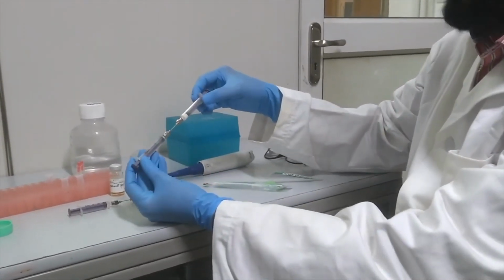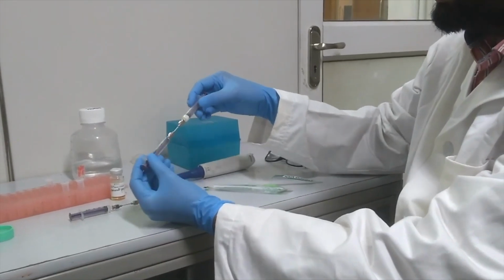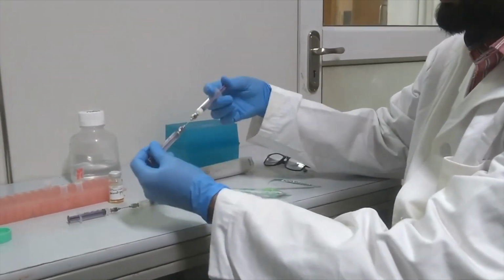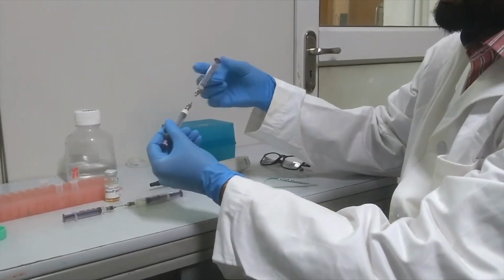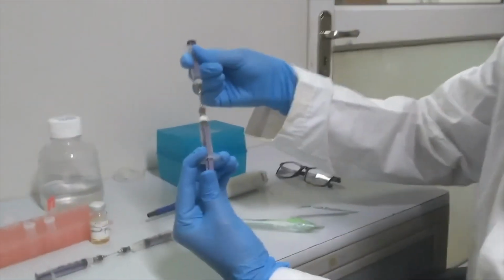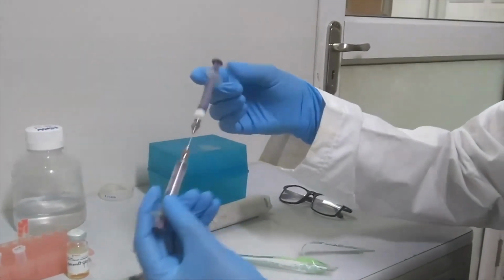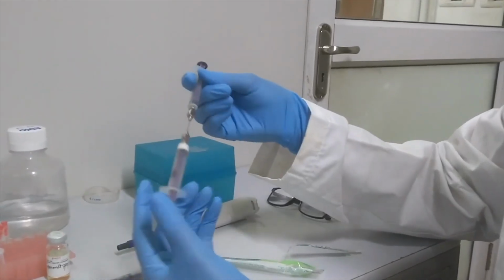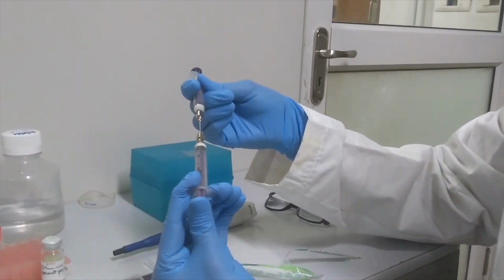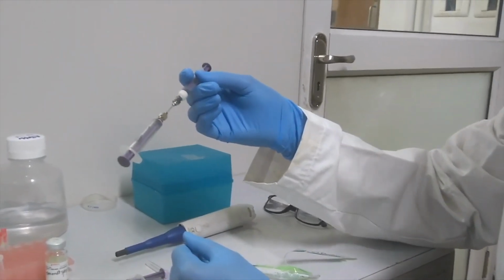This emulsion looks white. Initially it was two phase and then slowly it has turned into single phase. Now you can push this emulsion from one syringe to another syringe. This process creates a very good emulsion which doesn't separate out later on when you are ready to inject.